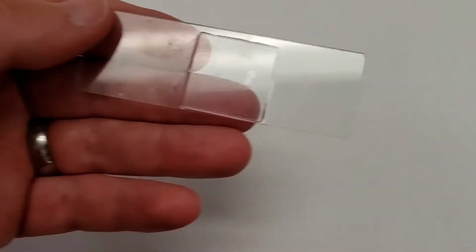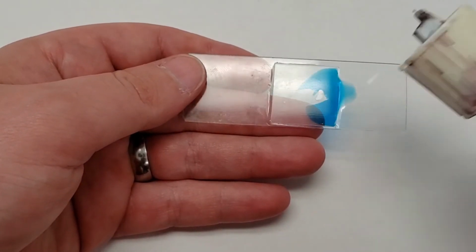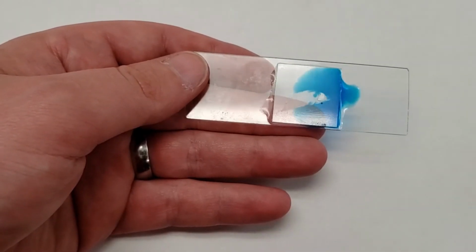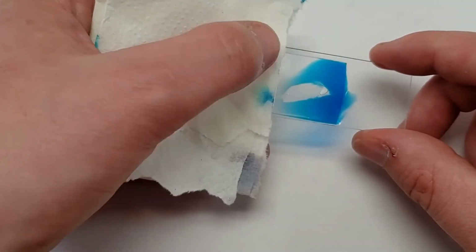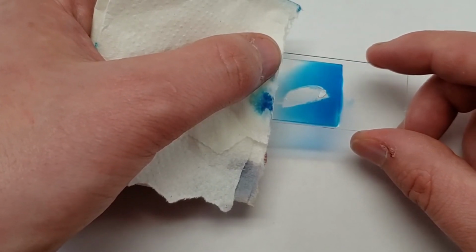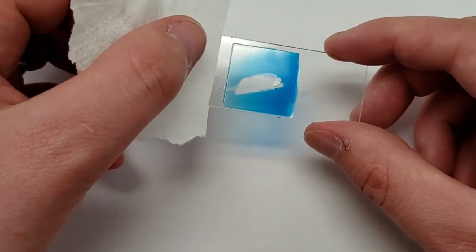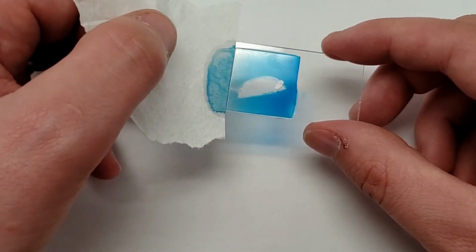Next, we're going to stain our sample with either iodine or methylene blue. Iodine has a brownish yellow color to it, and methylene blue is blue. On one side of the cover slip, place a few drops of the stain of your choice, and on the other side of the cover slip, place a paper towel to the water sitting under the slip. The paper towel will absorb the water under the cover slip, and the stain will fill the void of the water that's leaving from under the cover slip.